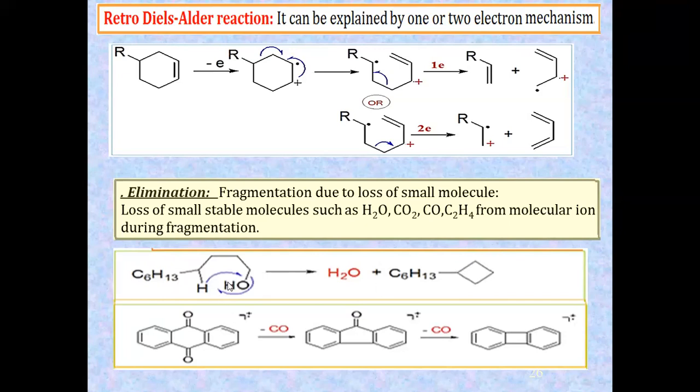As all of us know, the hydroxyl group is a strong leaving group. When it is removed, it takes the bond and the proton leaves the compound without its bond. So here we are going to have a carbocation, and this bond is going to form a cyclization due to the nucleophilic attack here. And this compound, which consists of a carbonyl group, according to the first loss of carbon monoxide, and then the second loss of carbon monoxide, is going to convert the structure from two carbonyl groups into this conjugated system.